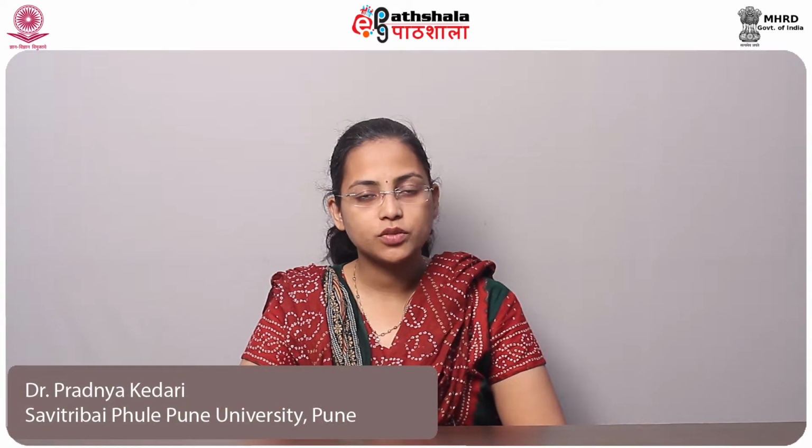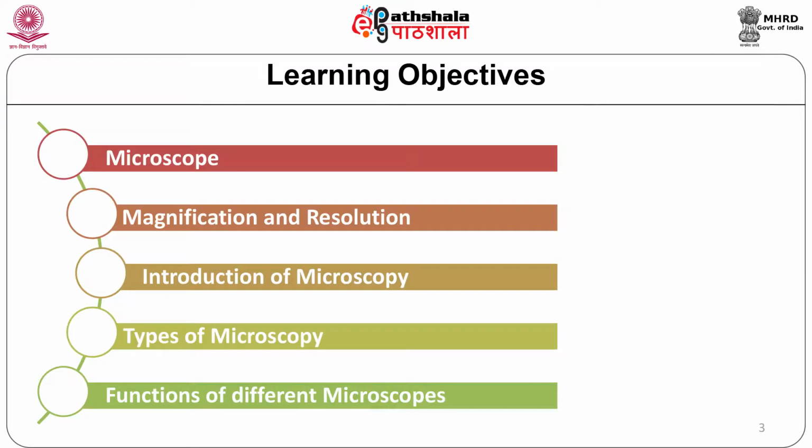Microscopy is a technique which is used to observe specimens which are too small to observe with the human eye. There are various techniques or various microscopes that can be used for this purpose. Today in this module, we will study the types of such microscopes, their advantages and disadvantages.